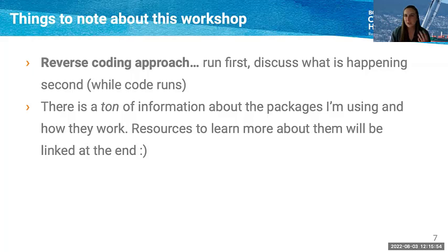For this, it's going to be a little bit faster, so it won't be as much of that reverse coding approach. We'll just talk through things as we go through all the steps. So please ignore the second bullet.